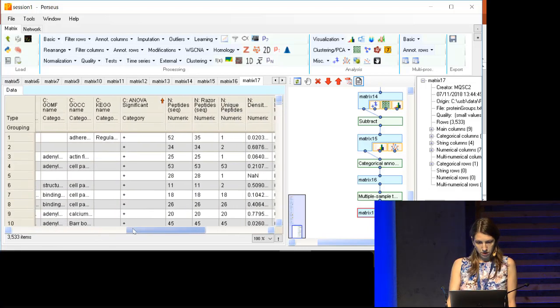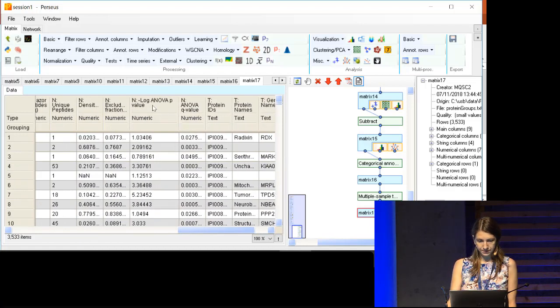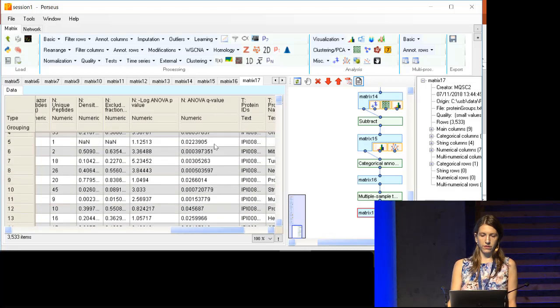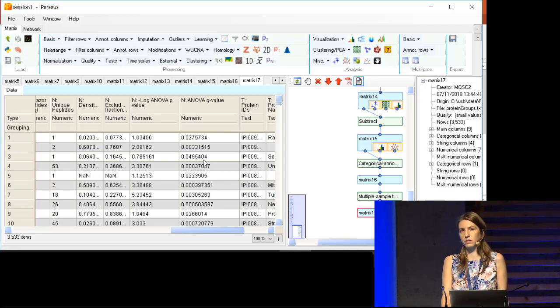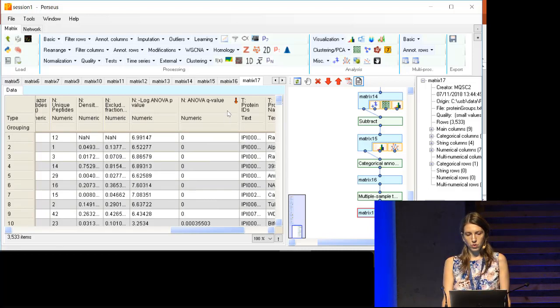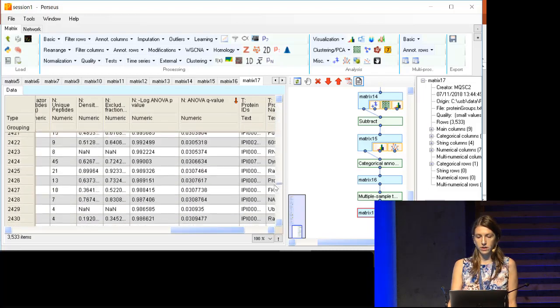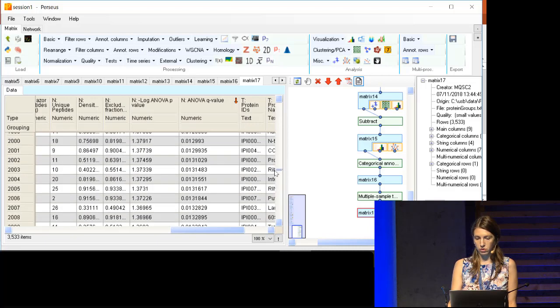So the other 2 columns that are produced as a result of the test are the minus log p-value here and the corrected p-value or the q-value that is here. So you can also use this to trim down your significance level. So we chose 5%, but you could also sort these ones, and then if you want a smaller FDR, let's say 1%, you could also just filter it at a lower number, say everything that is smaller than 1%.